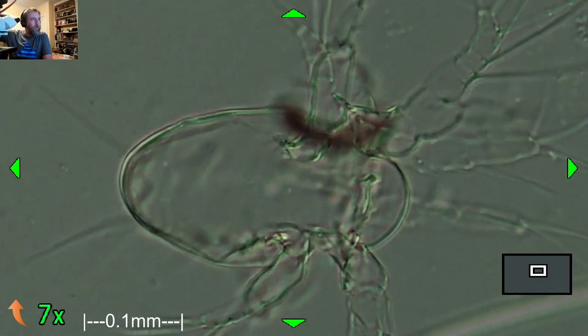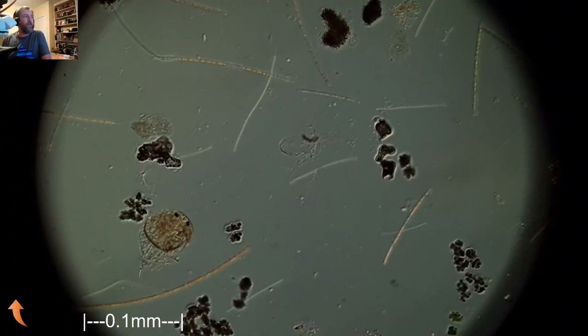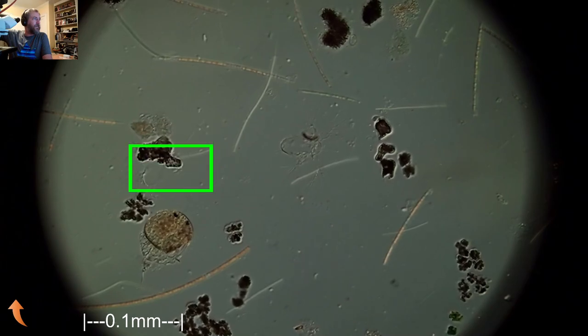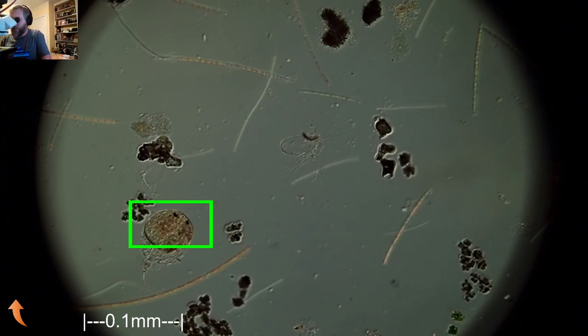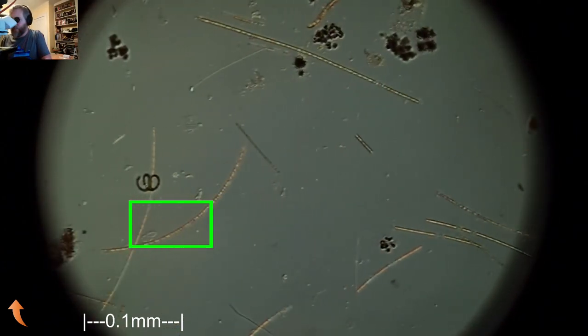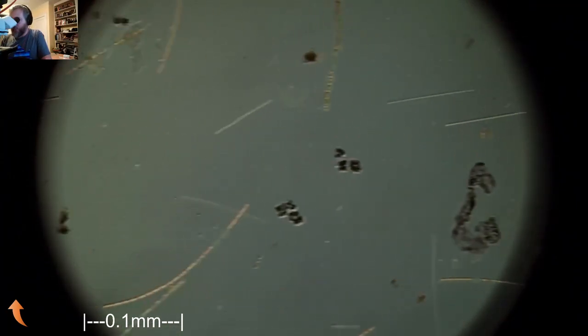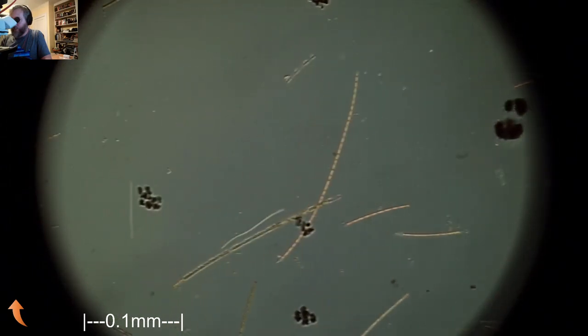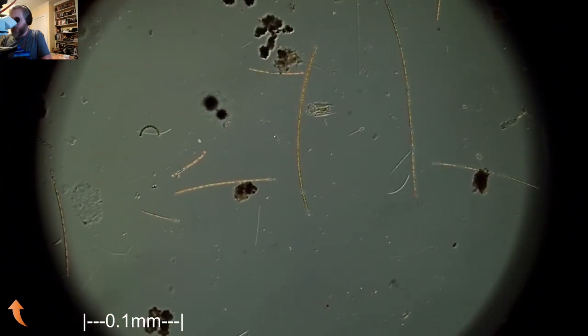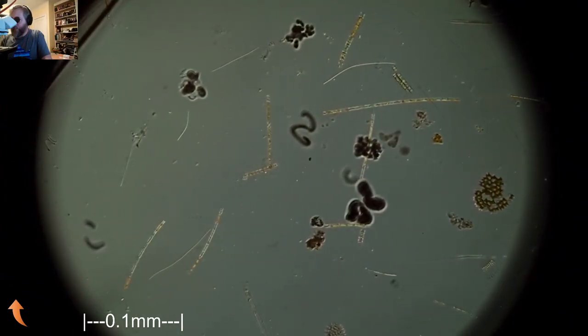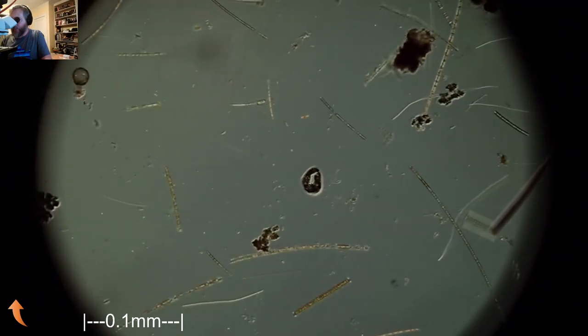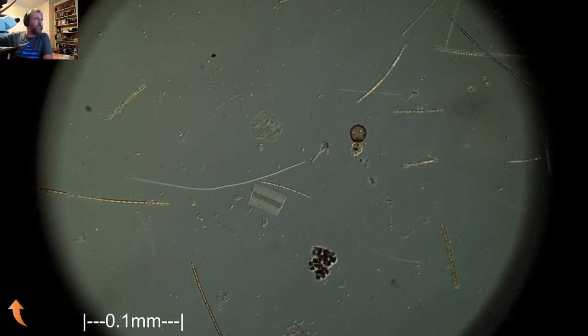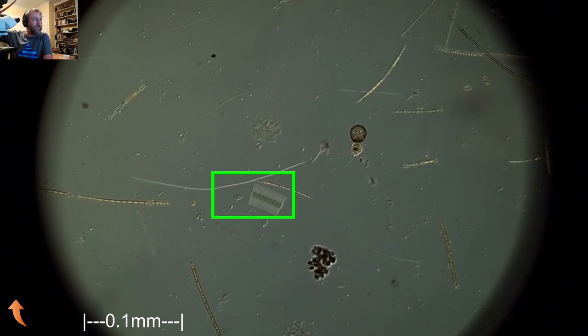Or freshwater copepod. And there is another Chydorus right there. So I won't zoom into it, but this guy down here is a Chydorus. And there's a bunch of pieces of zooplankton all over in these samples. Just bits and pieces of their skeleton. Probably molts from when they were alive in the water. As I mentioned, I collected this with a plankton net. I did a couple of vertical tows off of a pier. So I could get out in the water a little bit. But it was still only about a meter deep. I think that is a dinoflagellate hiding right there.